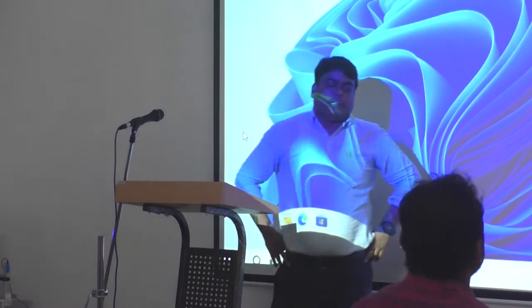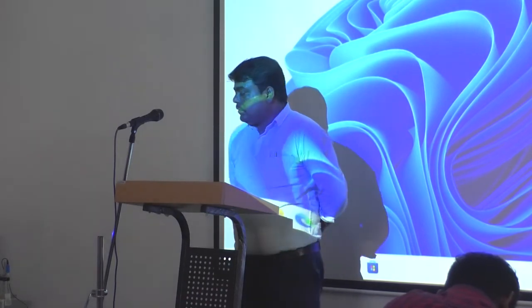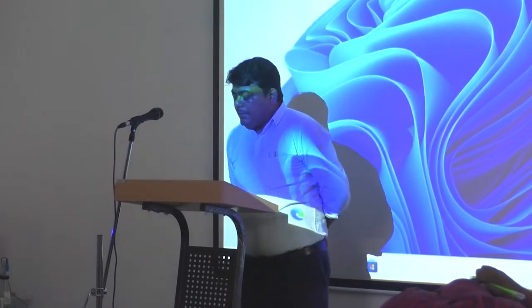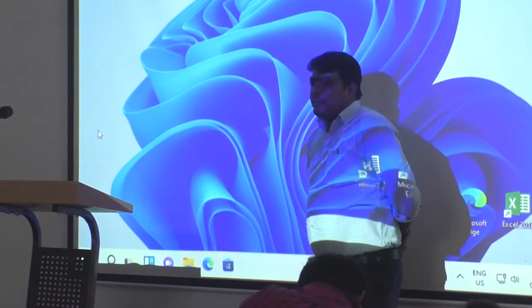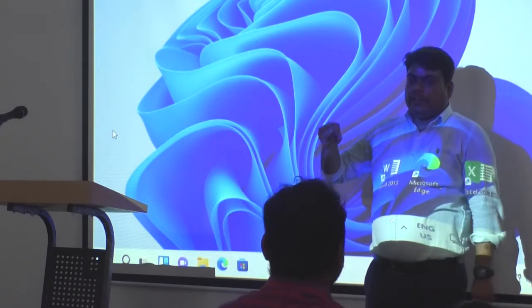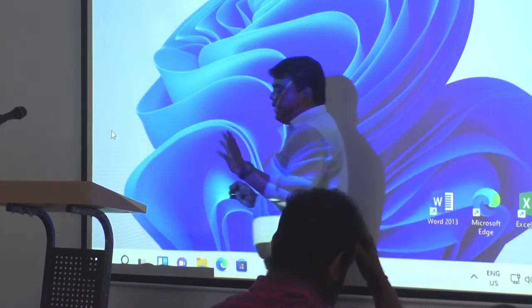Now, second step. Note the room temperature and adjust the temperature correction if required. अभी टेम्परेचर का तो रीडिंग आ नहीं रहा है. Temperature is not shown in the display, so by using the knob you have to select the appropriate temperature.